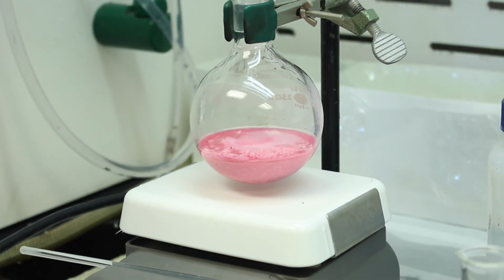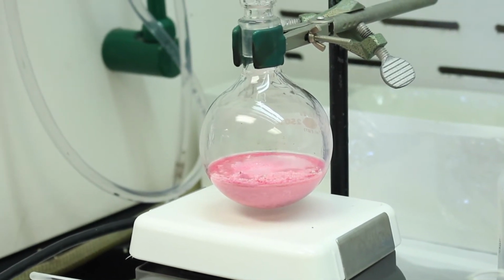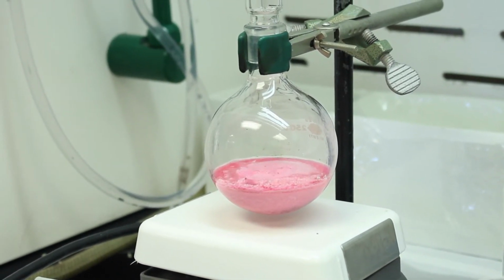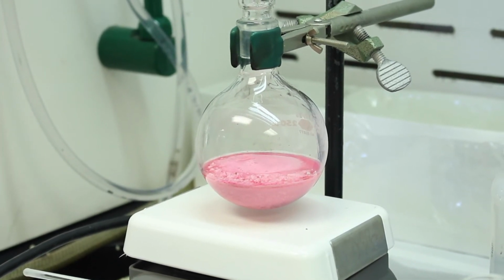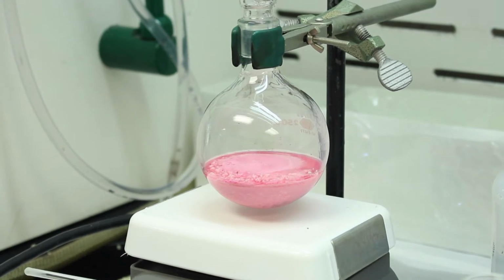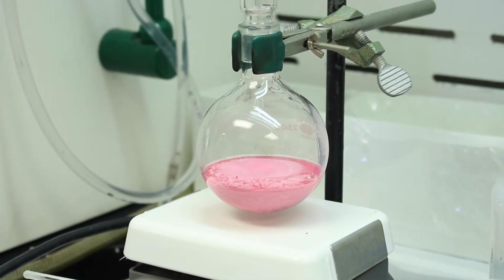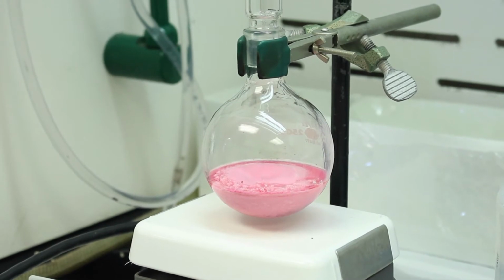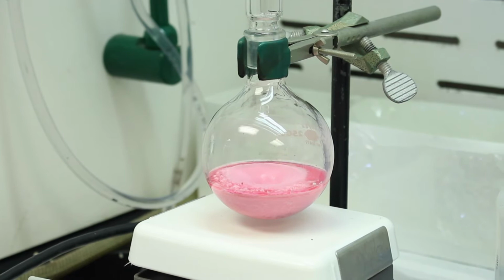In fact, so much so that the stir bar is getting a little clogged. So it went from looking like fruit punch, now looks like Pepto-Bismol. There we go. So I'm having to turn the stirring very vigorously to get everything integrated.